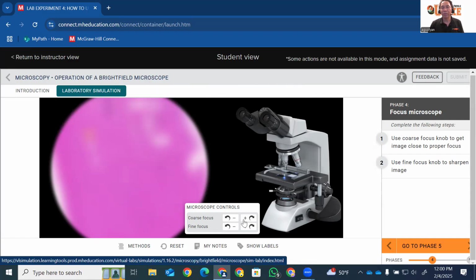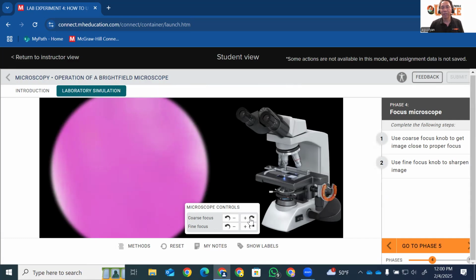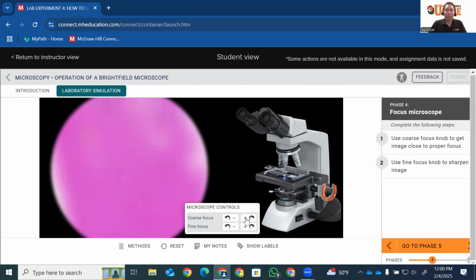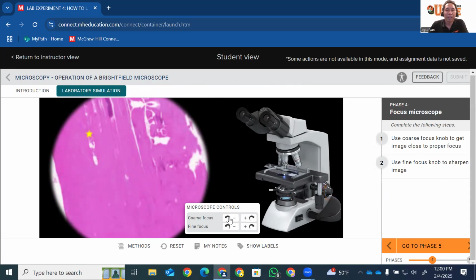So this is the controller for that one. Okay, this is what we click. So we click, let's say plus, it's going down. Maybe we have to make it go up. Going up. See, you can play with this one. If it is more blurry, it means that it's not the right direction, and you have to go the other way. Oh, is it too much? Okay, you see this? Now it's blurry again. Then down. I think this one is good. Let's see. Oh, blurry.